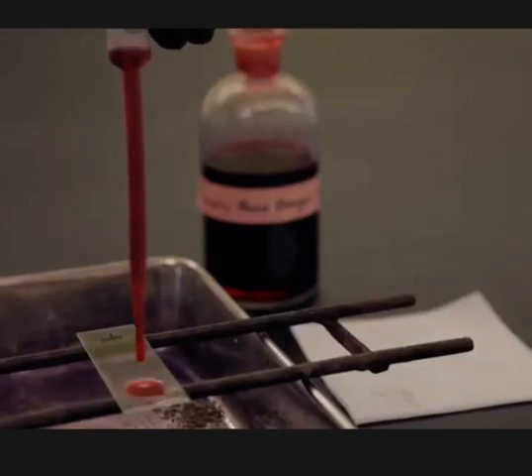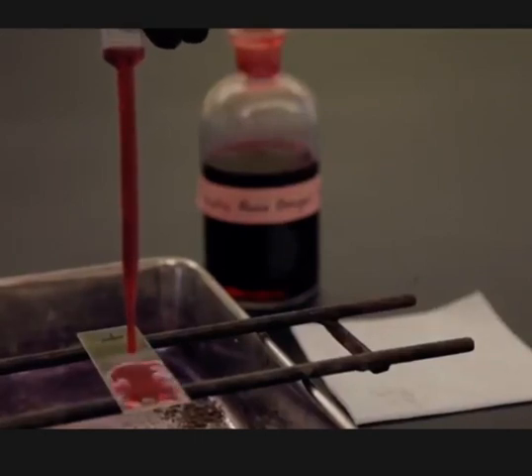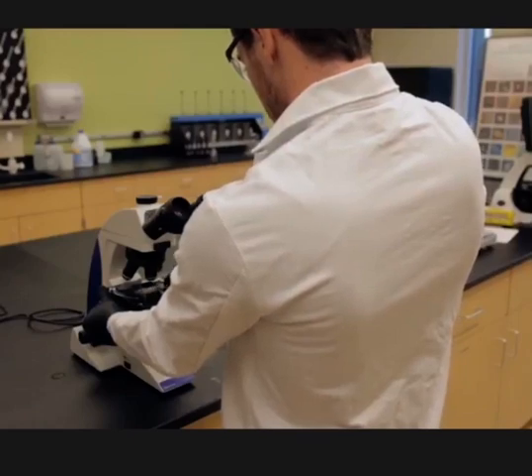Now that you understand the principles behind the contact slide assay technique, let's take a look at the process in the laboratory.